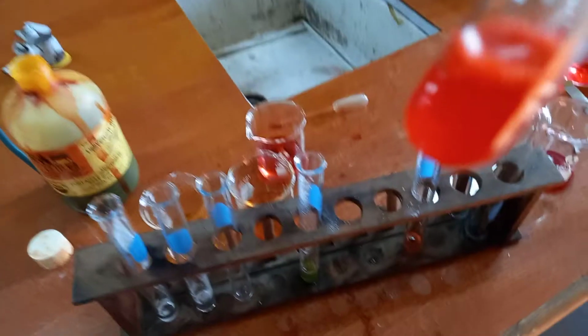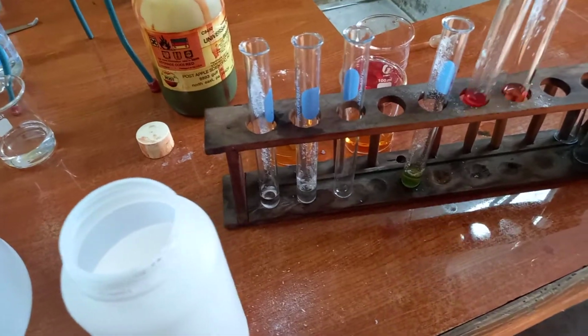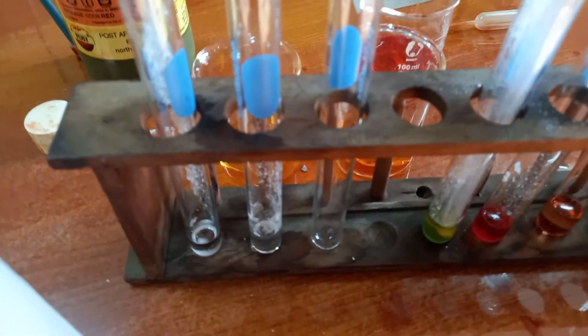And I want you to note the color, it is changing, right? Look at the differences in the colors. Let's add some more sodium carbonate again. So let's add some more sodium carbonate to our known aldehyde, right? So you can see the different colors.